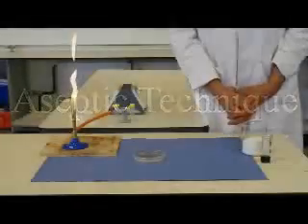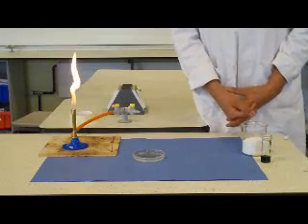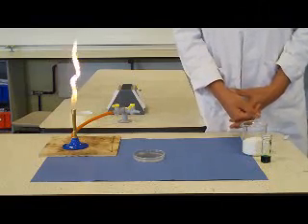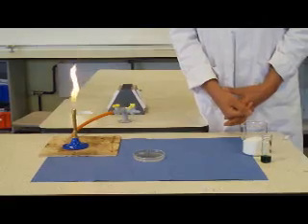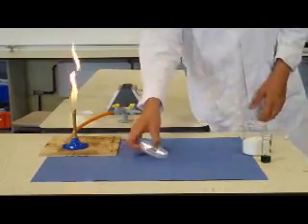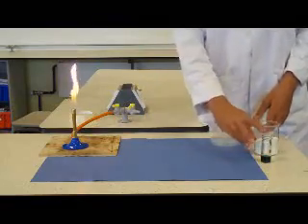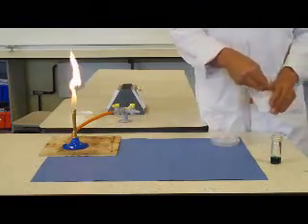Aseptic technique. This is part of the triple science specification in AQA, is a can-do task in OCR Gateway, and is linked to both Edexcel and to 21st century science. Many students take a slightly casual approach to aseptic technique, and one of the strategies I use to try to underline the concept of cross-contamination is to use a powder.